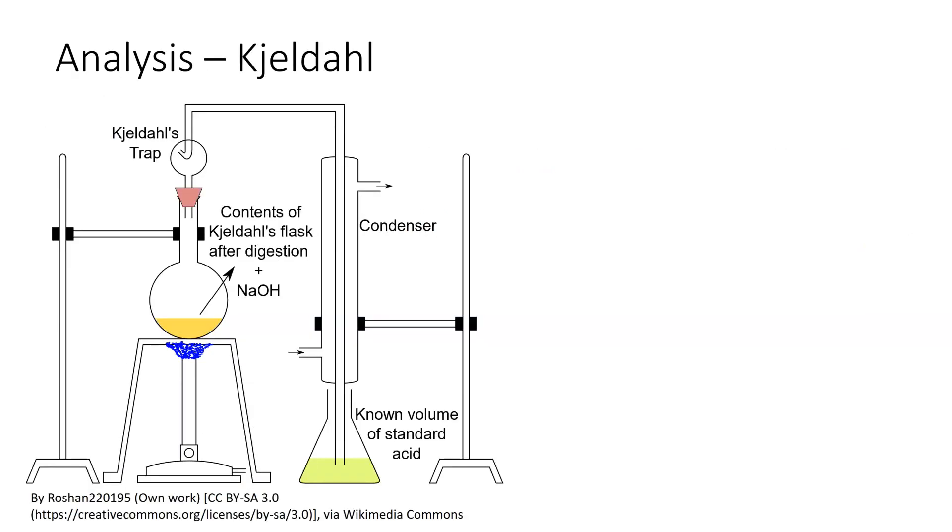The next step is to take the material you've got and boil it in the Kjeldahl flask with sodium hydroxide. You can see that there is a trap up at the top so that it only allows gas in and does not allow in the water vapor. This will allow the ammonia to be generated, travel up through the glassware. It comes down the condenser where it will come in contact with a known volume of standard acid. You can see the end of the condenser is under the acid layer.